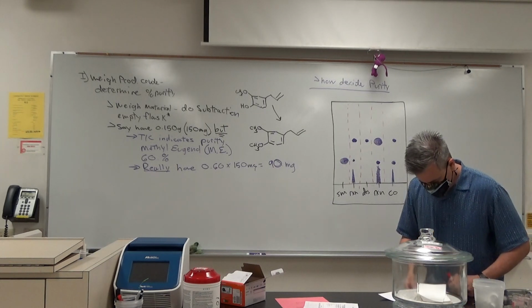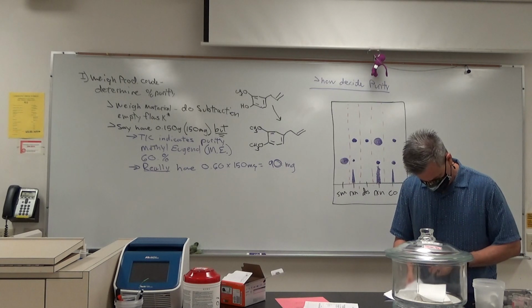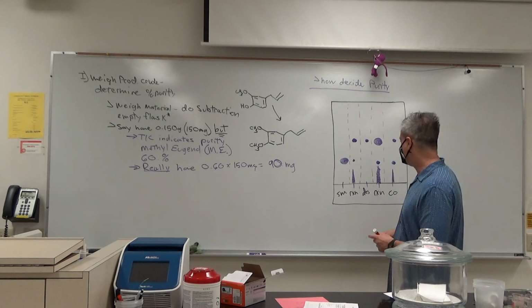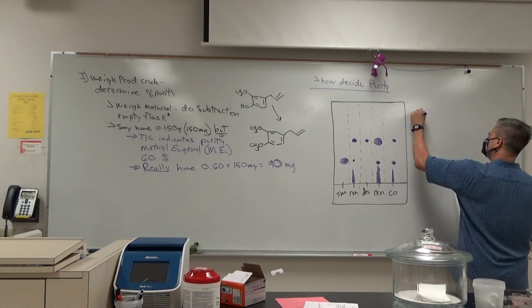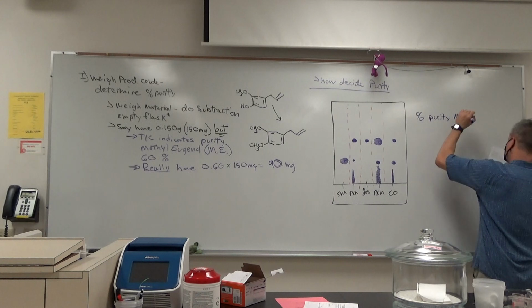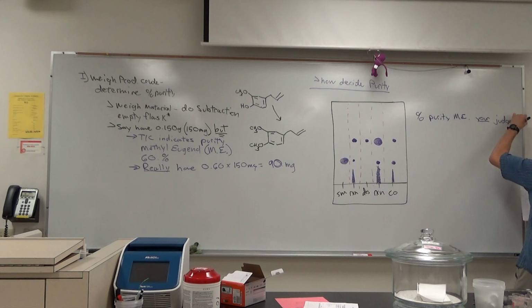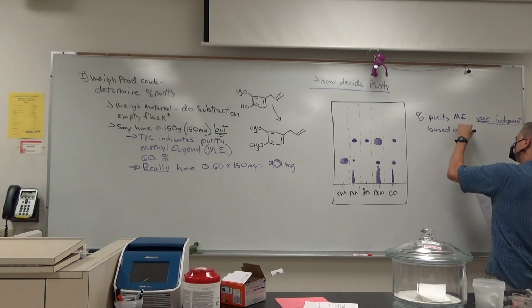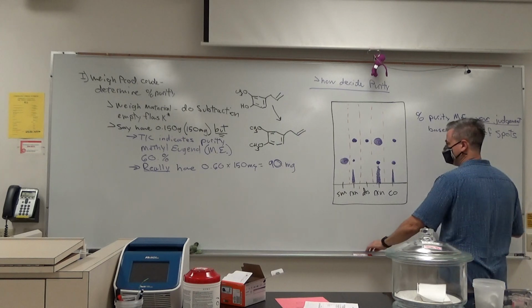I wrote something down. Let's say percent purity of methyl eugenol in your reaction crude is your judgment, based on size of spots. So I'll show you what I would do.